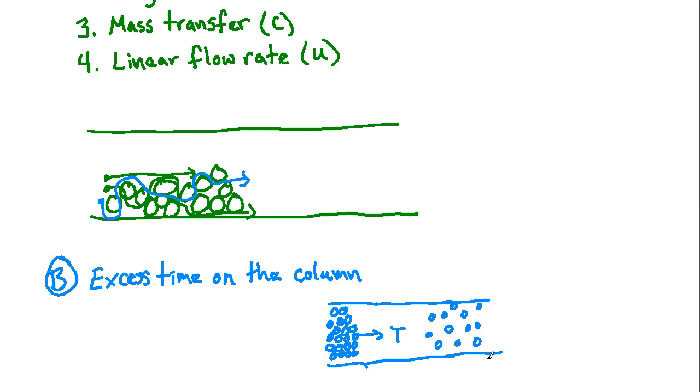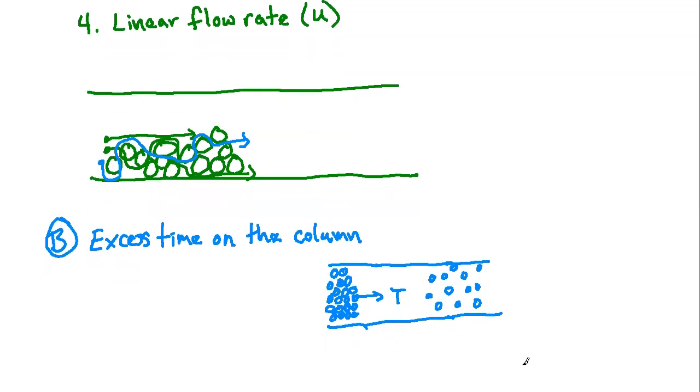It's going to kind of move as a group based on its retention time and its intermolecular interactions with the stationary phase. But having really long run times can be problematic here, okay? So you're going to end up getting that diffusion, and it's going to naturally start broadening if there's too much time that's being spent on the column. And you do have to watch flow rates here.